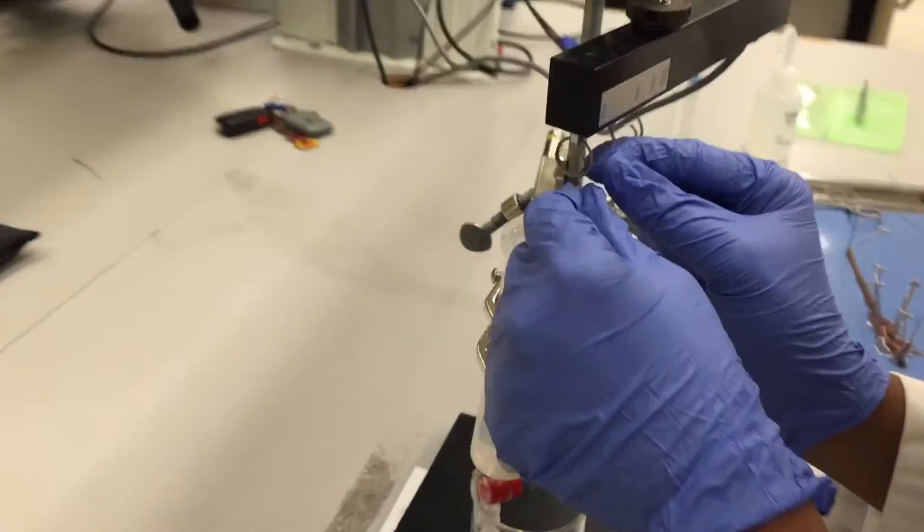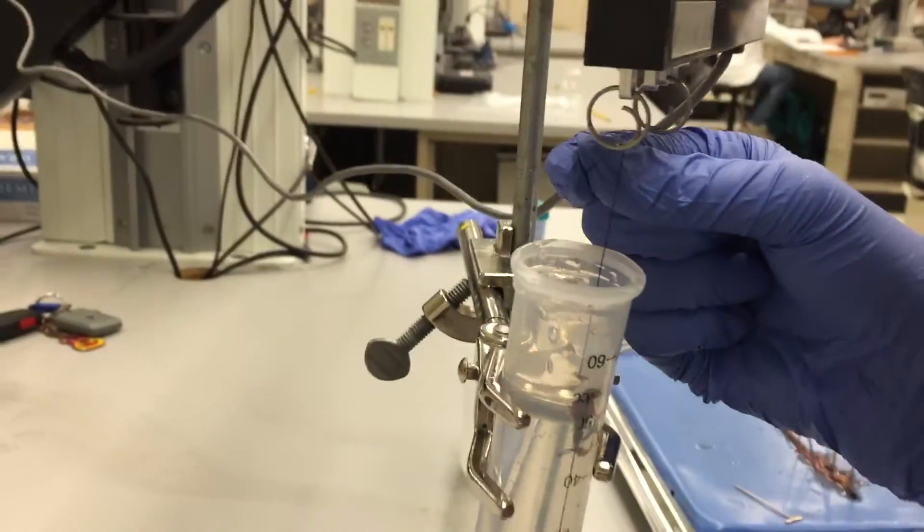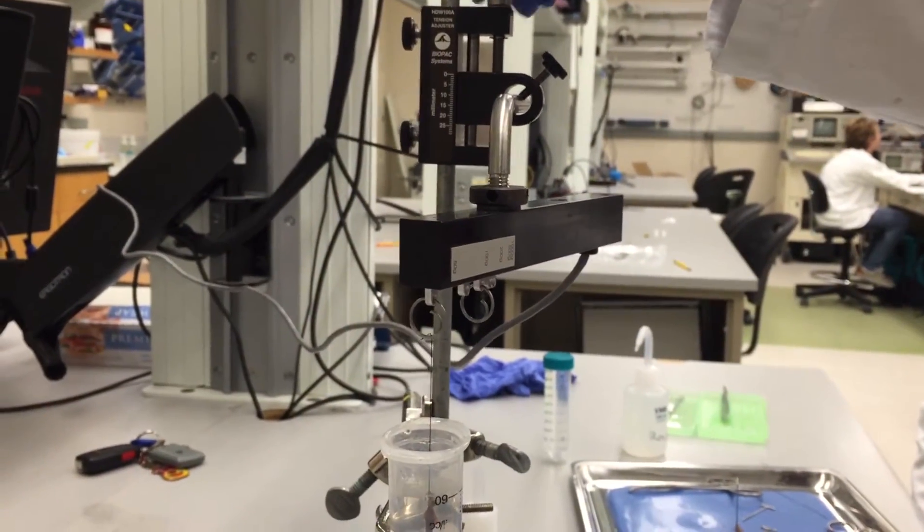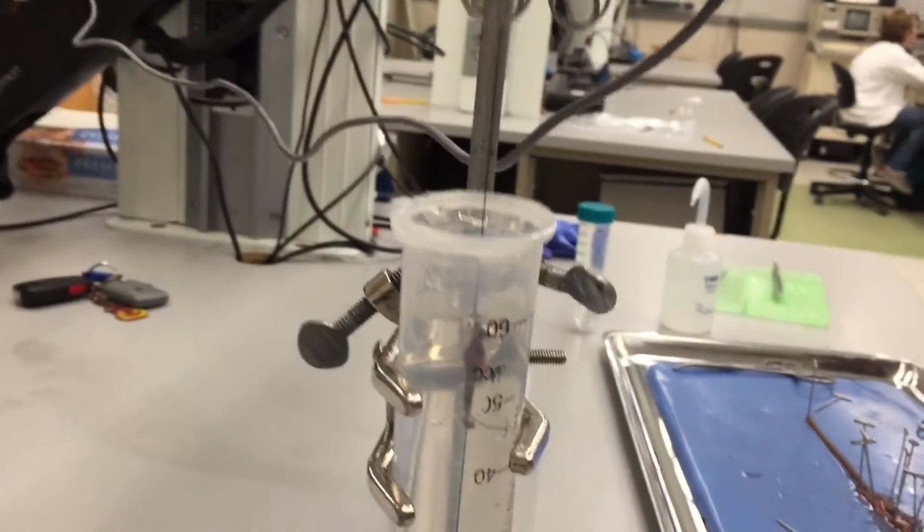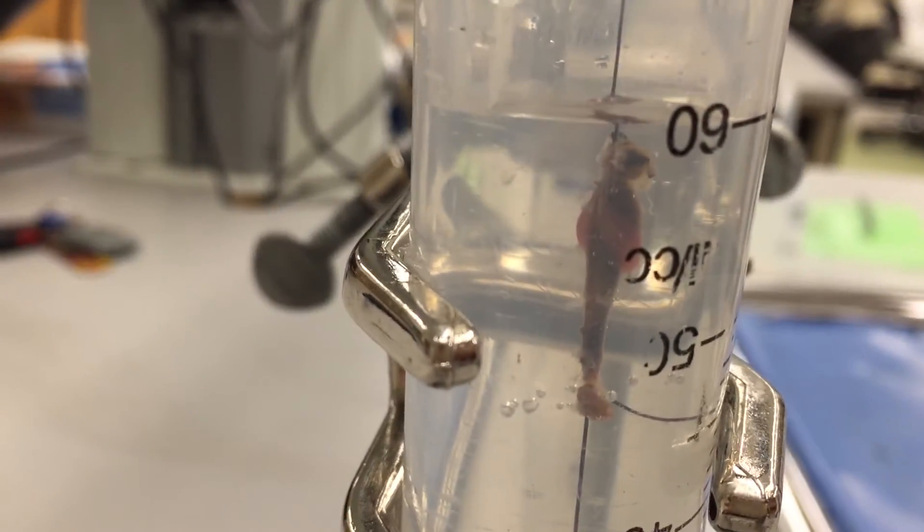Now you can attach the suturing string at the other end of the crop and gizzard to the force transducer. Using the tension adjuster, you can ensure that the crop and gizzard are under enough tension so that you can observe the contractions, but not under too much tension as to destroy the tissue.